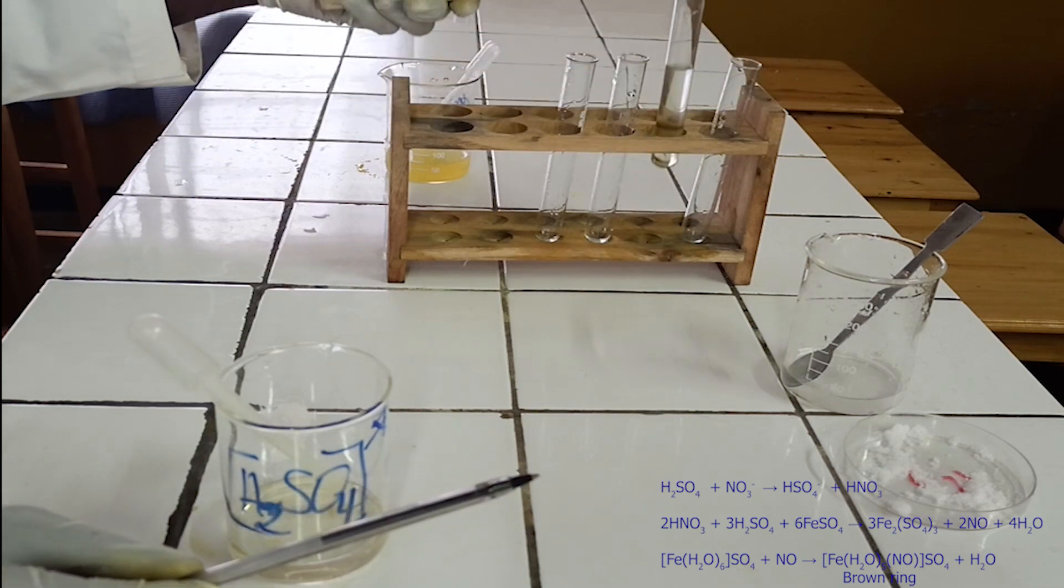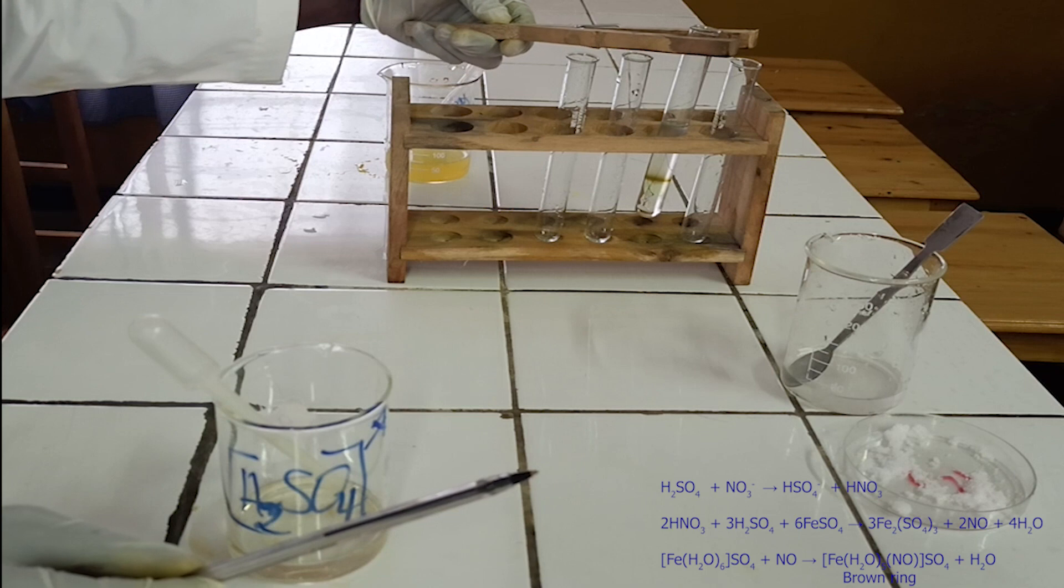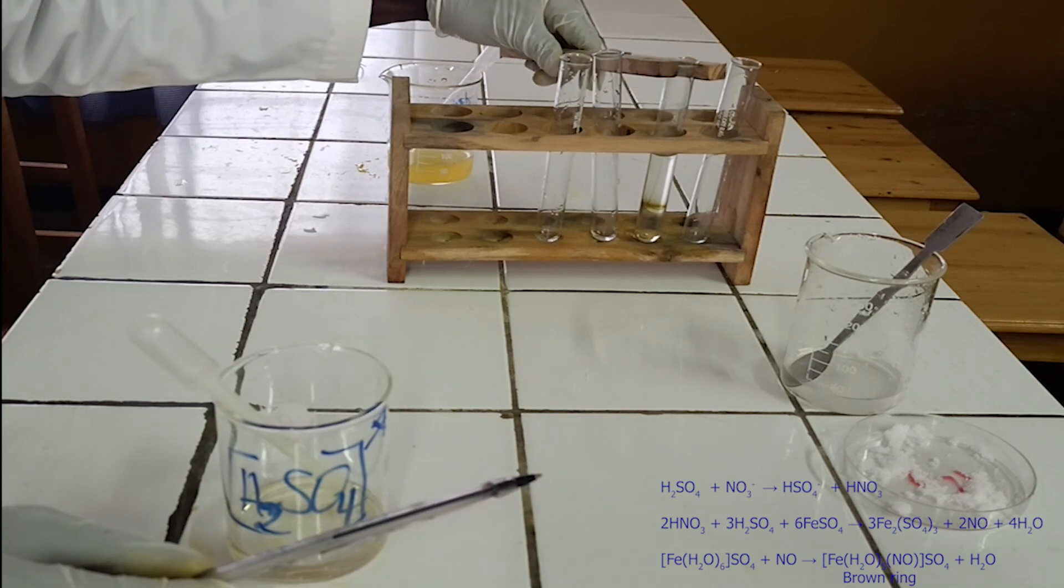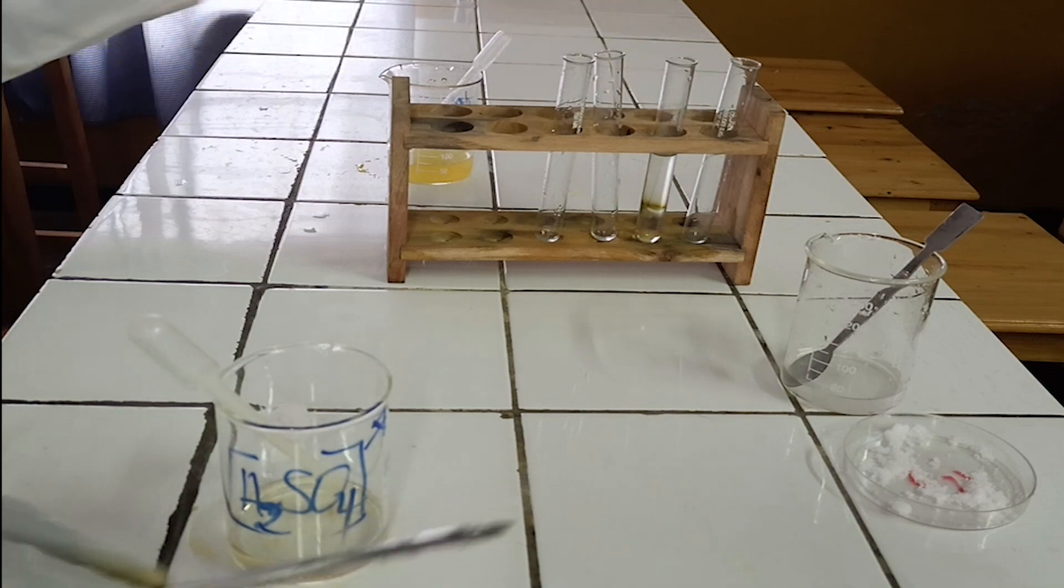Freshly prepared iron-2-sulfate is used to test nitrate because iron-2-sulfate oxidizes immediately to iron-3-sulfate when exposed to oxygen gas.